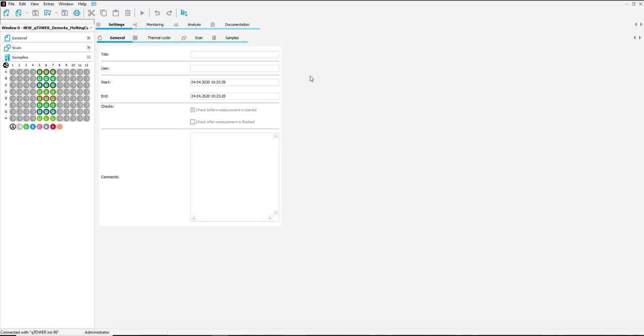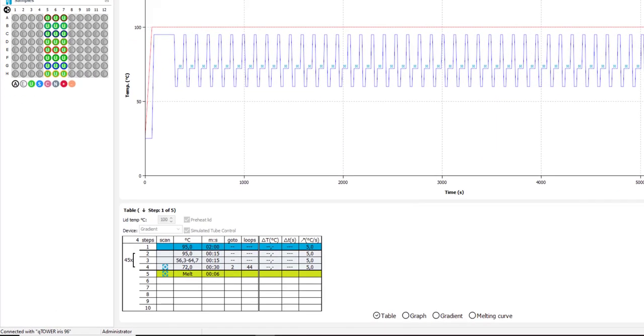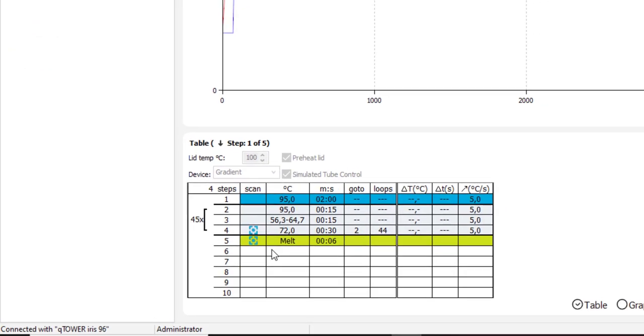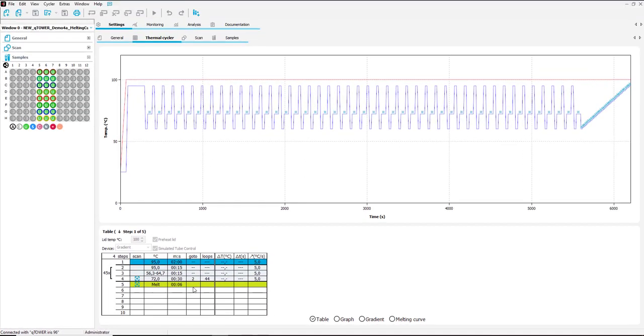In the thermal cycler protocol you see that a classical three-step protocol was applied and of course that a melting curve was activated.